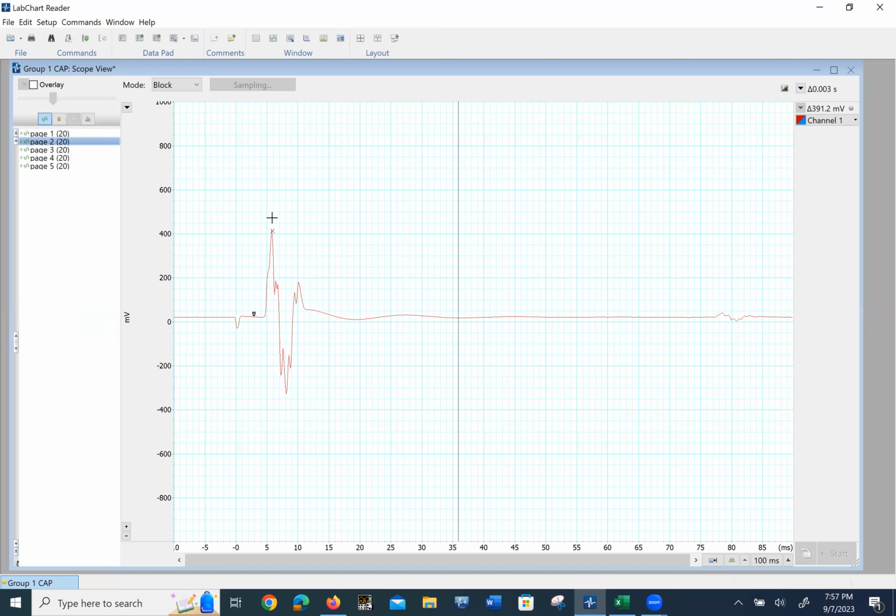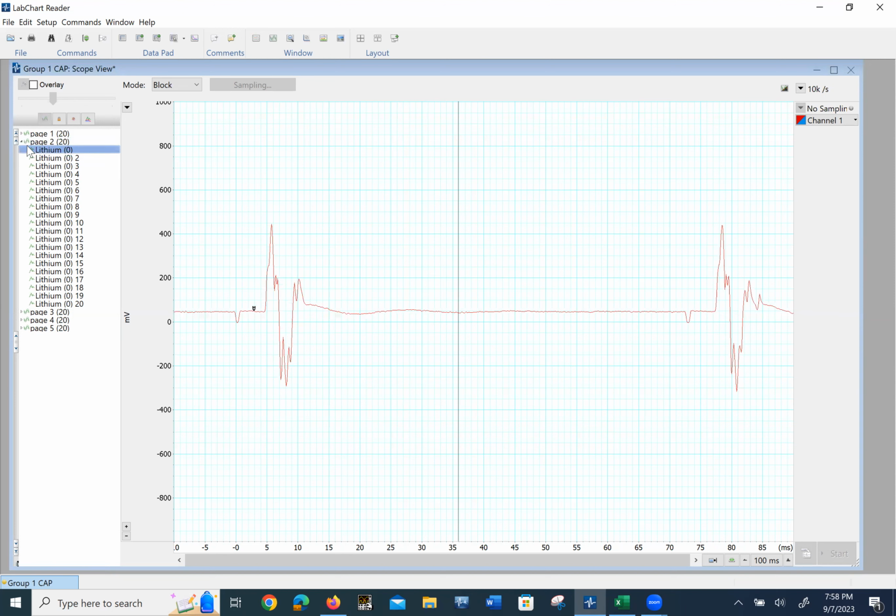How about the bottom one? What did we choose? The initial one? The first one last time? Let's go back and make sure we chose the first one that we could measure. Well, it's kind of weird. Maybe we don't want to pick these peaks because it's kind of weird. Okay, let me just stay with the first peak. All right, that's fine. Everything's a little bit changed.